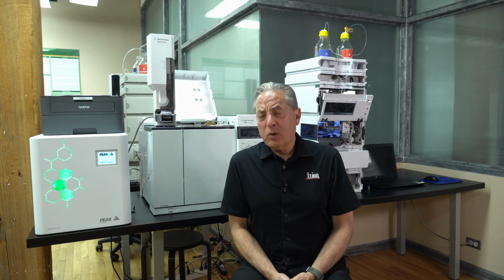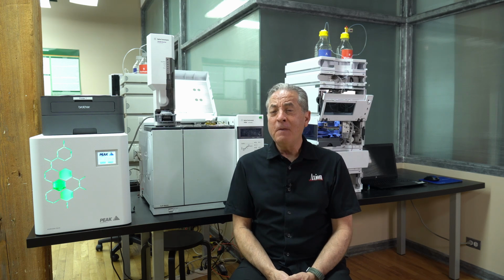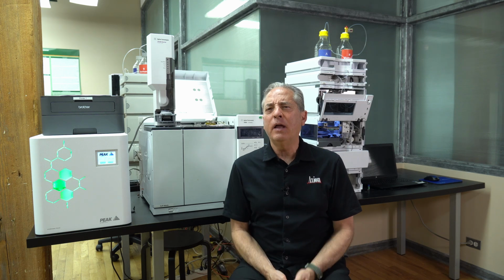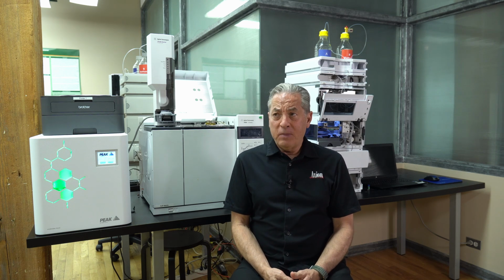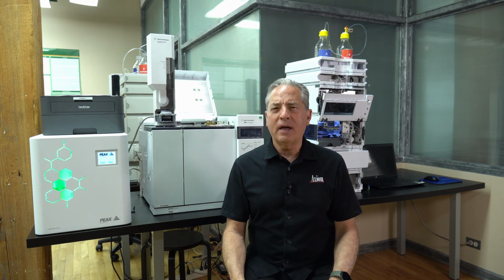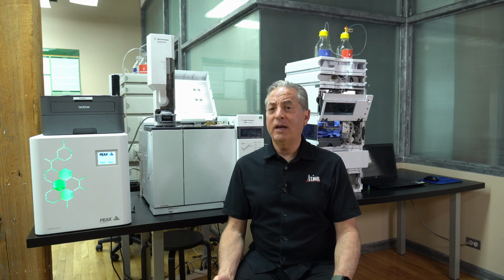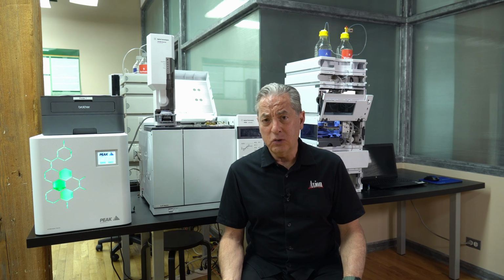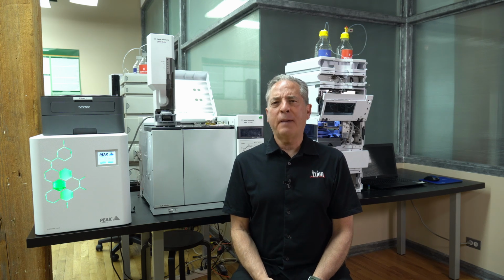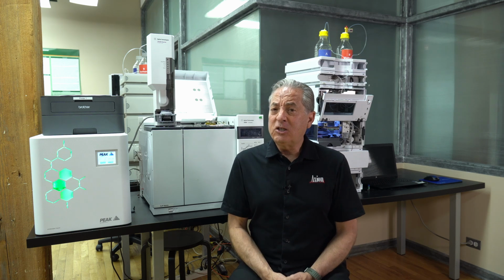So let's say the job description you're looking at includes lab manager or some sort of management responsibility. One of the things you're going to be asked about is safety. Safety is number one priority. So I think about GC, of course we're going to think about the normal things like we should be wearing safety glasses in the lab, especially if we're cutting columns or working with liquids. It's a good idea to never wear open-toed shoes in laboratories, so you don't spill anything on your feet. You want to wear a lab coat. So there's the logical, obvious things, but specific things to GC.